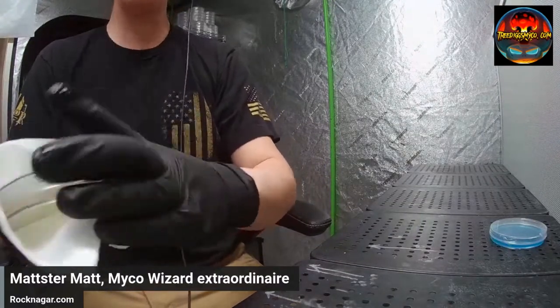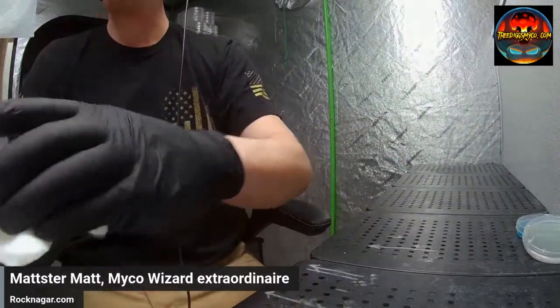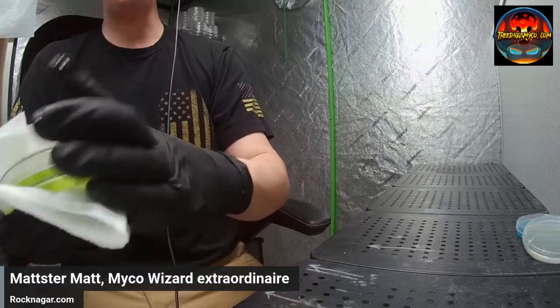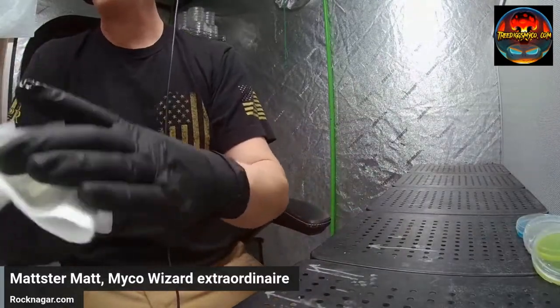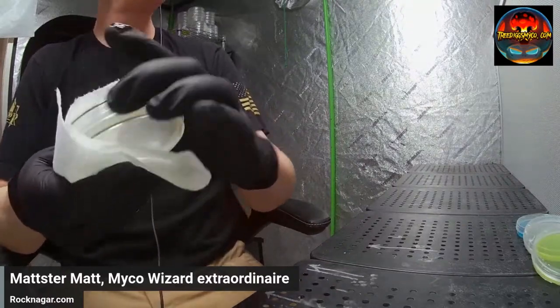I got my agar cooling in the pressure cooker right now, so it'll be a little while before we get to the actual fun part. But right now I'm going to draw some designs on these plates and do a couple cool little cutouts.